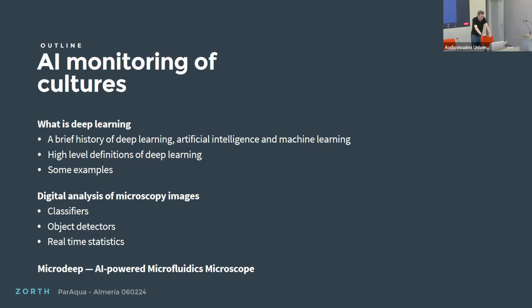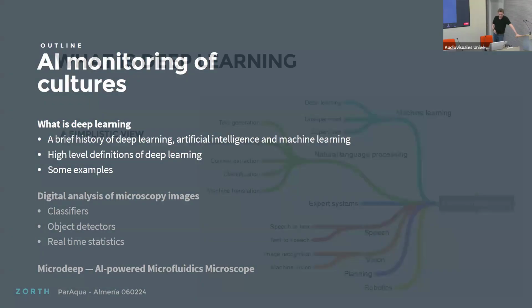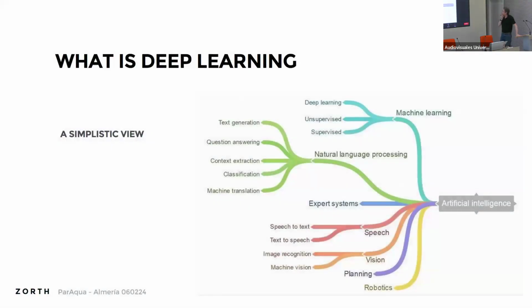And I thought, because of ParAqua, it's actually very interesting to level up everyone on what deep learning is, how you apply it to the digital analysis of microscopy images, and basically what we do with it with our microfluidics microscope. So, getting into it, what is deep learning? Here's what we call the simplistic view.